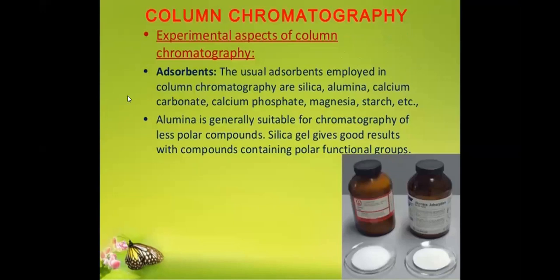Now see the experimental details, as we just discussed a little bit, in glass column chromatography.